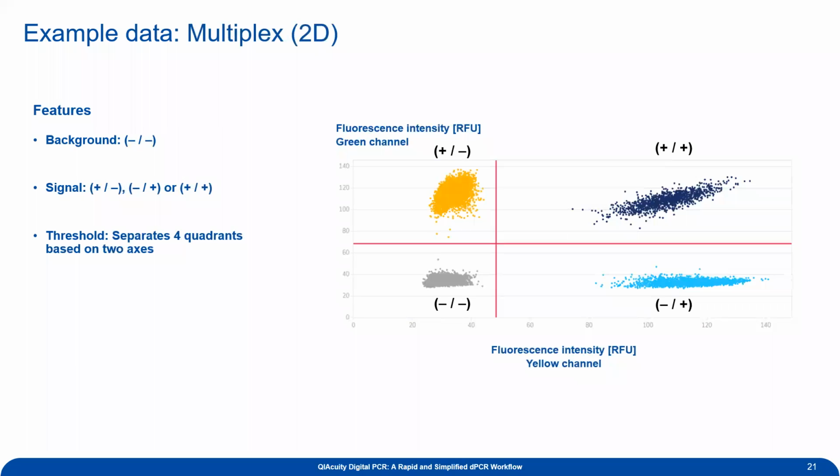Yes, so you could do different primer sets per well, or you could do all the same primer sets per well. It just depends on what your experimental design would be, so what you want to detect. In the video it was showing one individual well, but depending upon what you want to amplify on a per well basis, you'll do the correct master mix for that individual well.